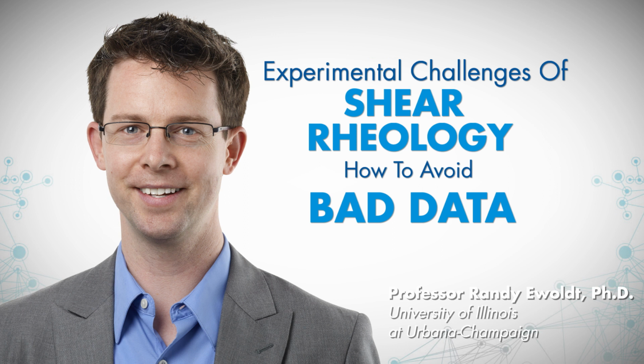The other thing you have to correct for with normal forces is also surface tension. Surface tension is well known to create pressure drops across curved interfaces, and so depending on how big or small your curvature is, or in what direction it is, where the liquid meets the air, that will also create a pressure jump. If it bows outward, you'll get a higher pressure on the inside of the liquid. If you're a little bit underfilled, it'll create a pressure drop, so you'll have a lower pressure inside of your liquid. So there are at least a couple of comments related to normal forces there, and where issues might arise and how to manage them. Okay, well, perfect.